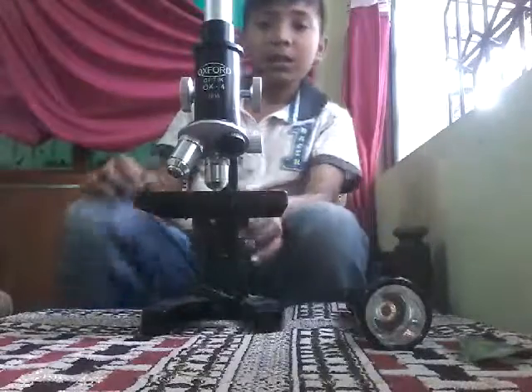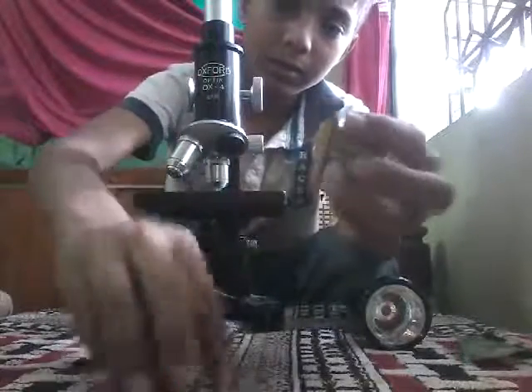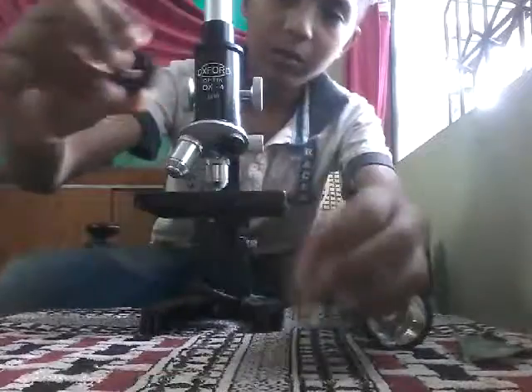So guys, you can remove all the parts of this also. This is also magnification.